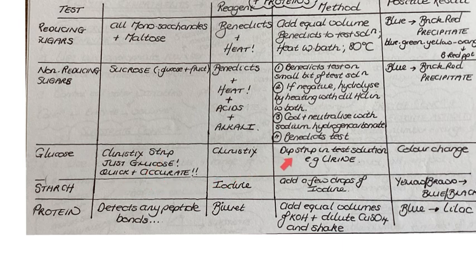So what is the method? You simply dip the Clinistix strip with the little pad at the bottom into the test solution, and the test solution might, for example, be urine, and a positive result will be a colour change where the pink will turn purple. And the deeper the purple change, the more glucose is actually present. So that is the Clinistix test.